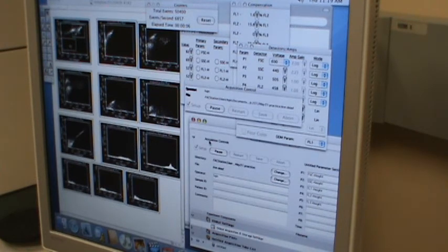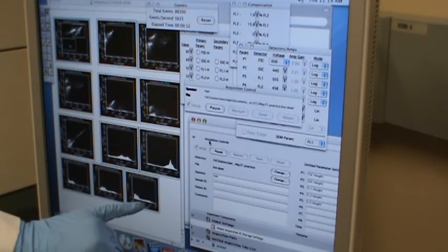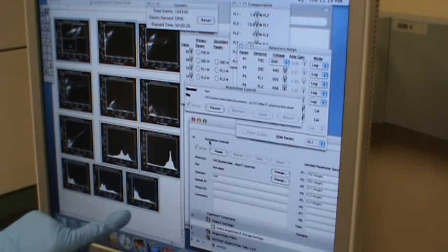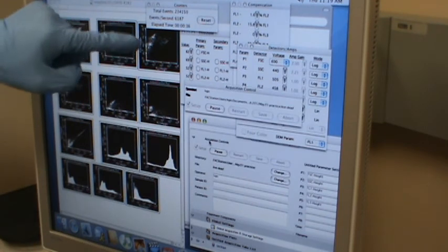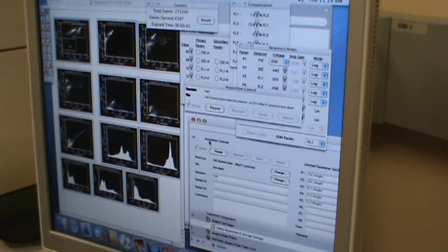Let me see. Well, it's not half, but you see a lot. Yeah, you see now that this time both FL2 and FL1, there's a lot of cells that have very strong signals. Yeah, here, these 2 channels, FL2, FL3. If you can picture in 3 dimensions, that's how it looks. That's FL3, that's FL2, that's the cell size. So in this circle, that would be the dead cells.